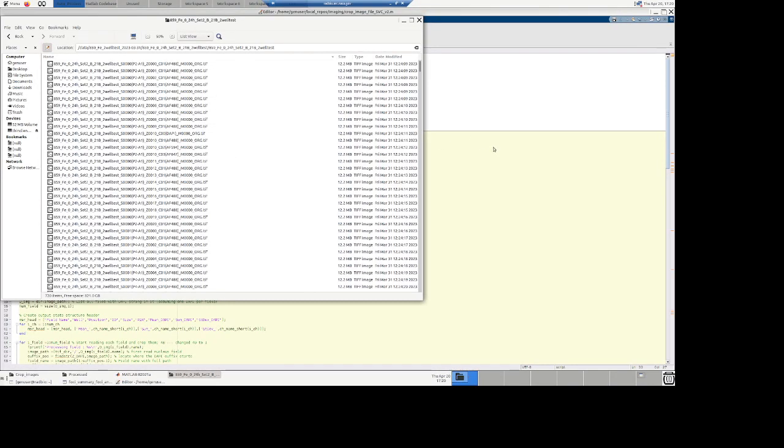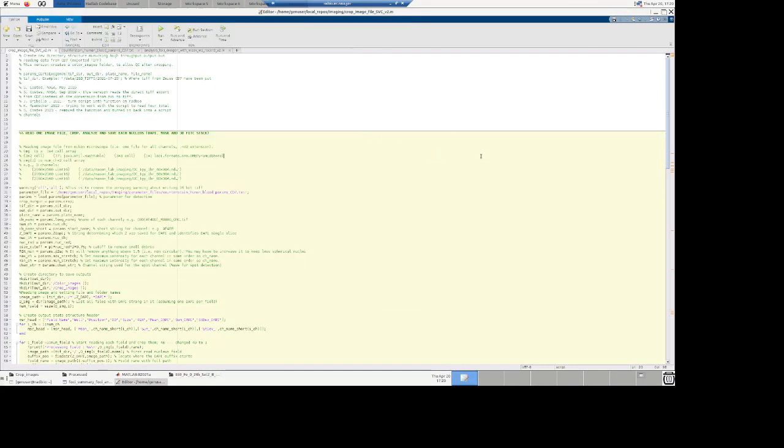Okay, so I'm going to try to quickly walk you through some of the code I put into GitHub. It is not exactly what was used to generate the images that were given to the big benchmark for human, because in this case we're looking at a 96 well plate. A plate was made of different wells, A1, A2, A3, and each well was run separately. So here, this is a simpler version that will look at one single directory and process it.